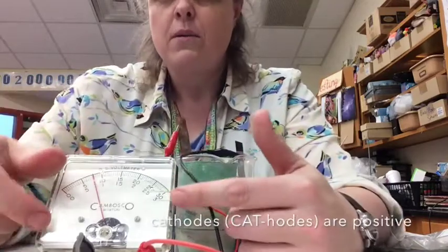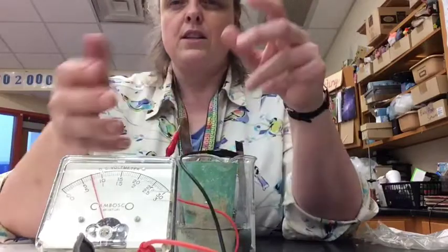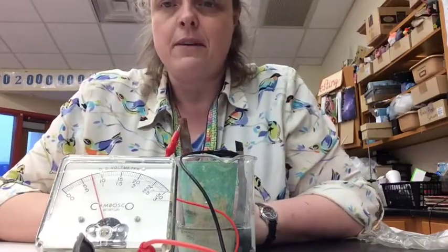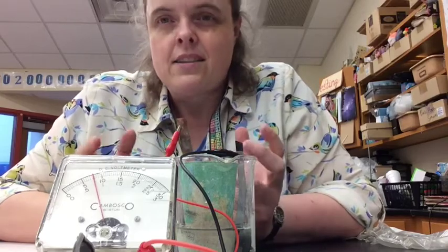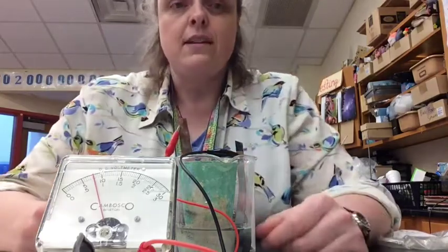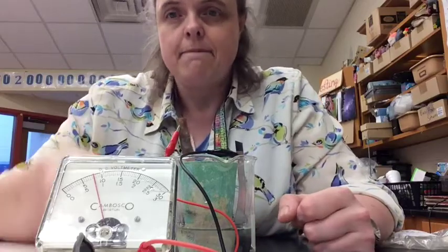So when you attach it, we're getting almost 0.75 volts, which isn't bad for a couple of liquids. Attach a bunch of these and I'd have a battery. Wait, I have a battery now. Huh. I'll see you on Thursday at 3 o'clock, where we talk about electrochemical cells and table J.